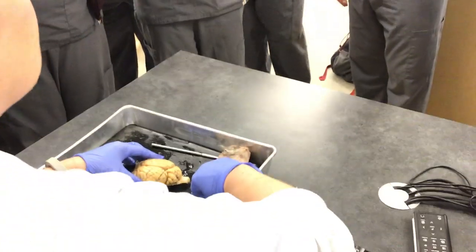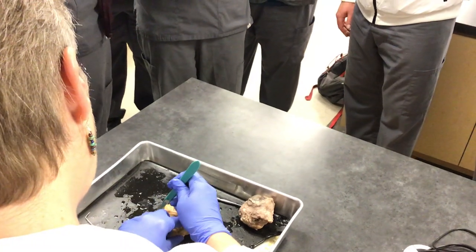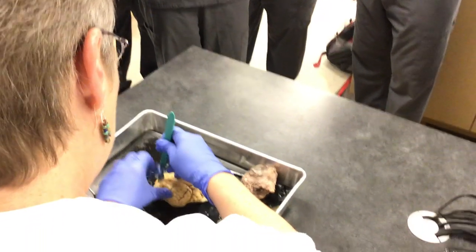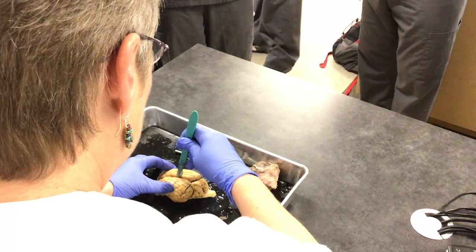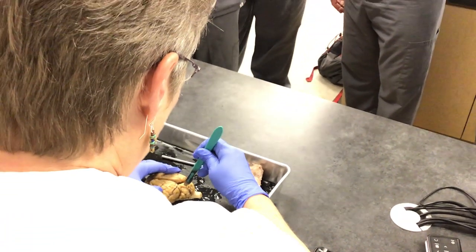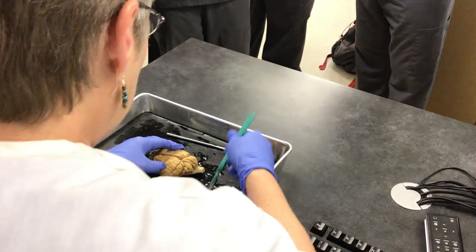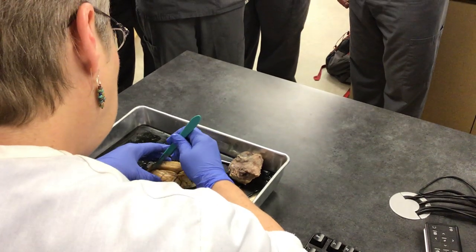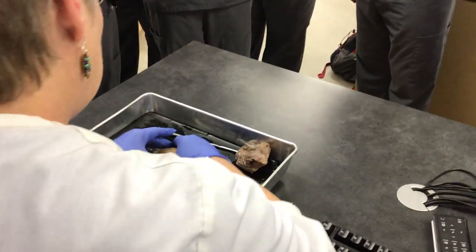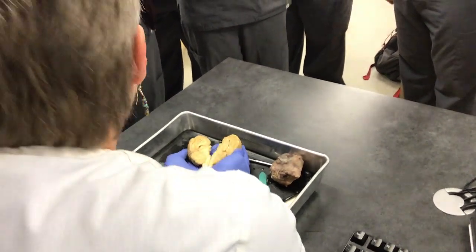When you make your dissection — the brain is so easy to dissect. You put your scalpel in the longitudinal fissure and very gently start cutting. You cut right in the middle of the cerebellum and the brain stem and go all the way down. At some point you can take your fingers and just spread it open, just like this.